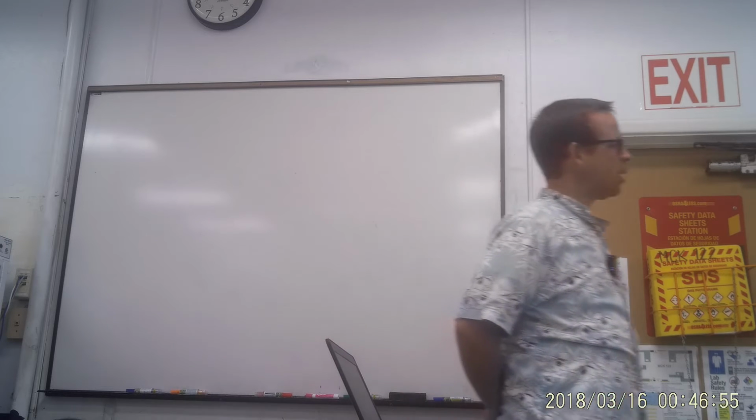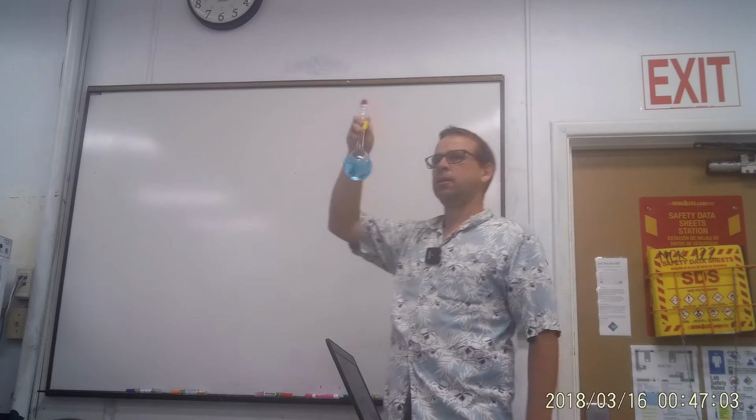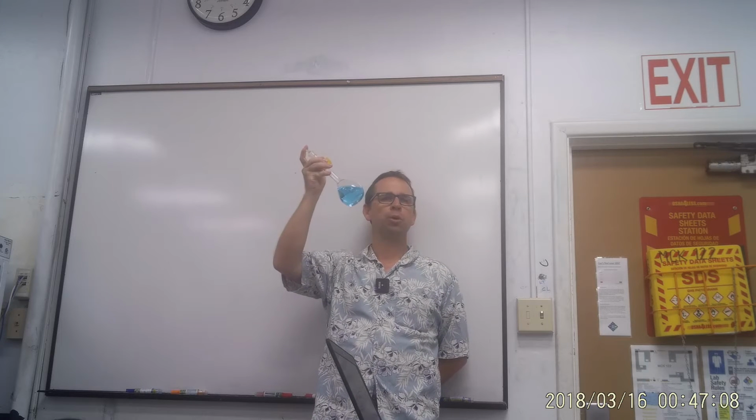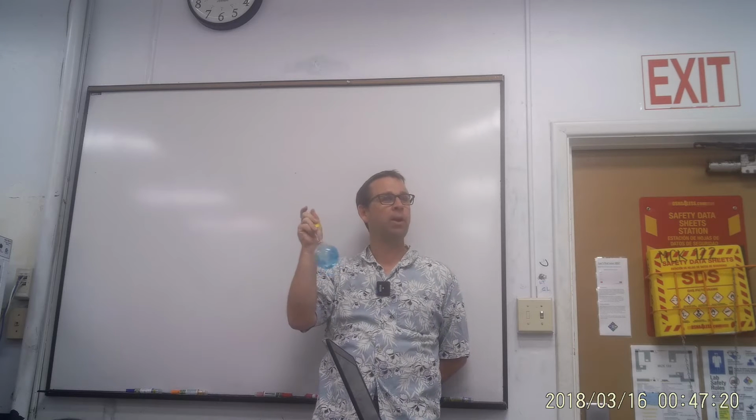Let me grab a solution here. I have this beautiful solution of copper sulfate. What wavelengths of electromagnetic energy are being absorbed by this copper sulfate solution? What wavelengths? Okay, red. What wavelength is that?